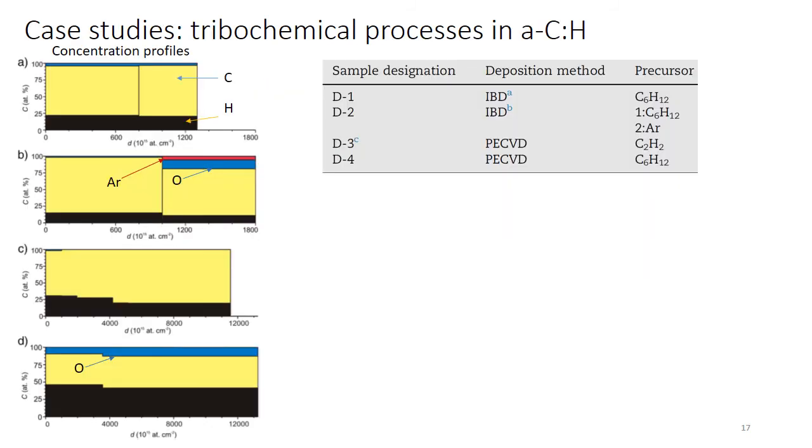And now I would like to show you how this methodology was used in studying carbon coatings, ionic liquids, and friction modifiers. As I told you before, we characterized triboemission from 4 coatings.